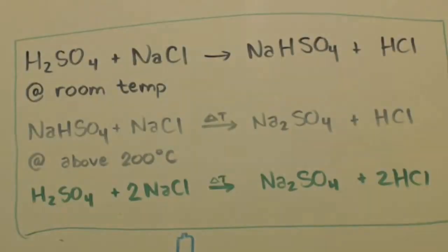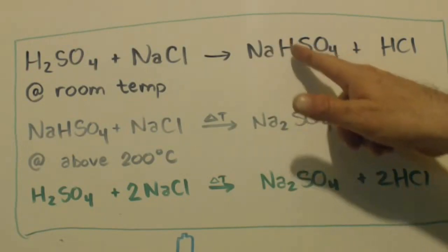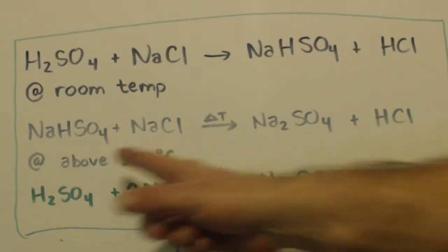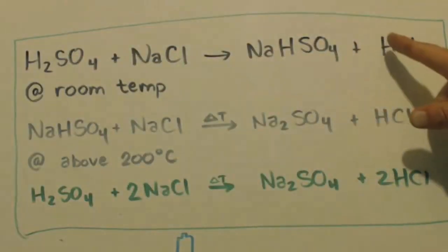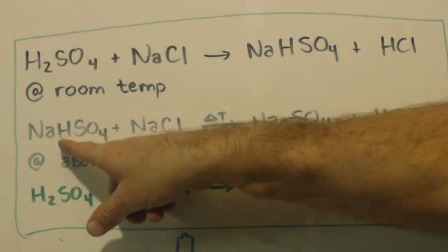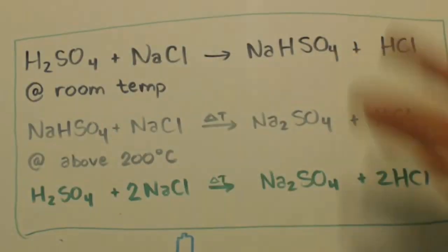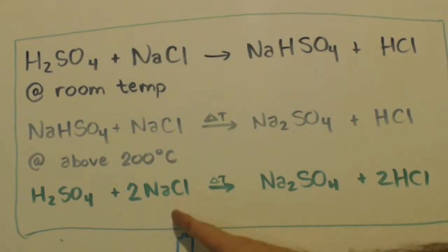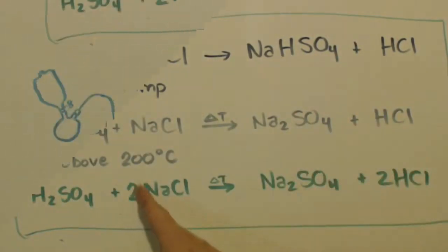Now this happens at room temperature. Because this is an acid too, right? It's got a proton there. If you want it to do some of the work, you would have to have it above 200 degrees Celsius. If you don't heat anything, then it's this one. So obviously, if you have some more salt in there, you can heat it up and you'll get even more HCl. So if you want to combine these and heat everything from the get-go, as you can see, this would be the formula. You'd need two chlorides, one for this first part, and then one for here, right?